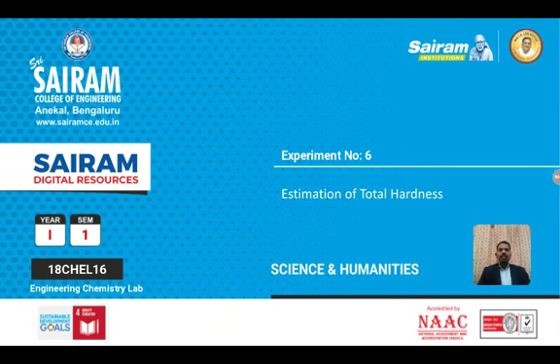In our previous discussion, we have discussed instrumentation. So what is instrumentation? It's determining or estimating a given sample by measuring some parameters such as conductance, potential, absorbance or pKa. That is called instrumentation, right?